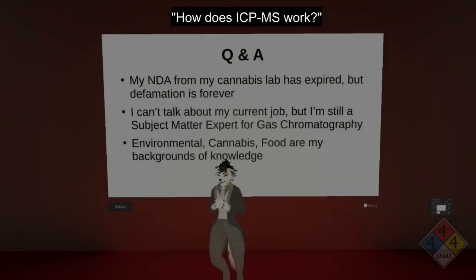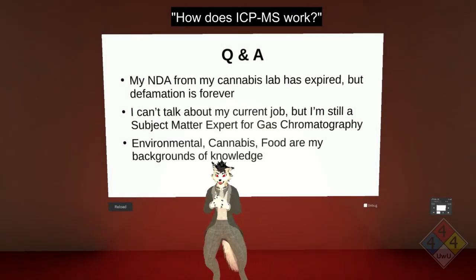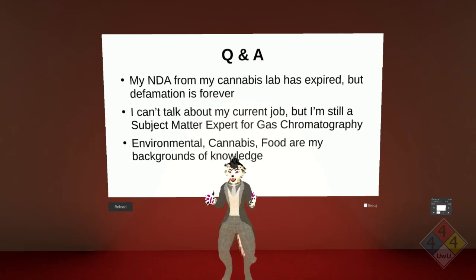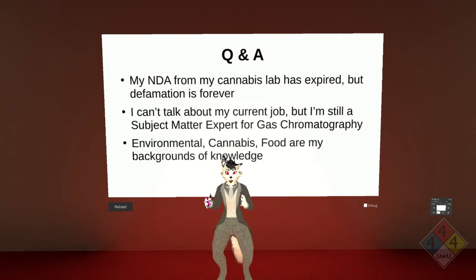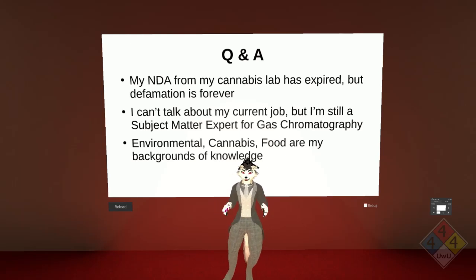Yes. Yeah, so the question was, how does an inductively coupled plasma system work, the ICP-MS? Each one of these instruments, by the way, would definitely be worth its own lecture, because the technology behind them, each one of them have their own niches and nuances, and being a good analyst requires a decent amount of knowledge on any one of these systems. So there's always the comment, you want a couple of years on any system to actually say you know the system, right? So with the ICP-MS, I talked about the digestion, where you're getting into liquid phase. Once you get into liquid phase, you need to get it into some sort of gaseous phase in order for it to interact with the plasma.